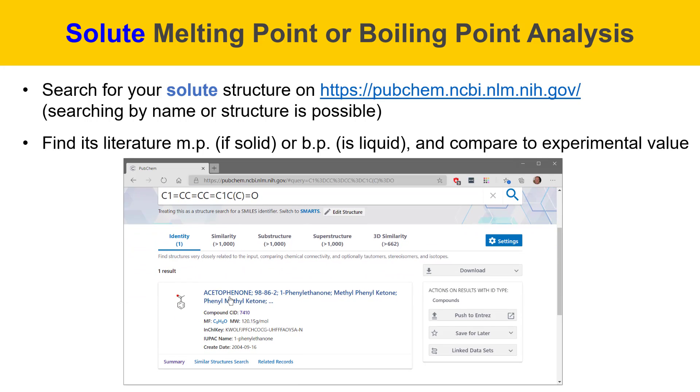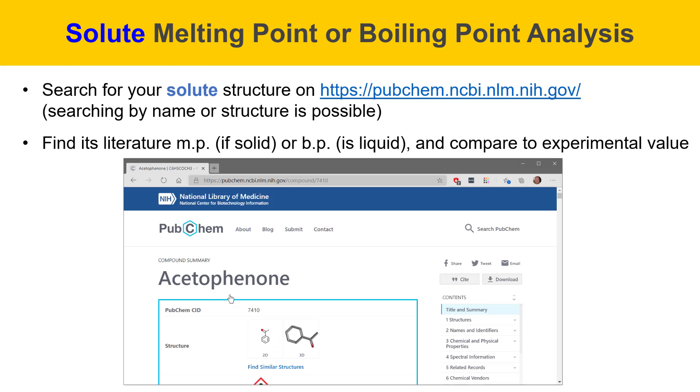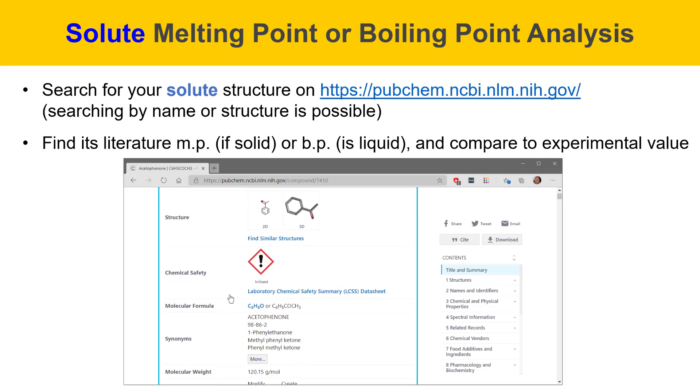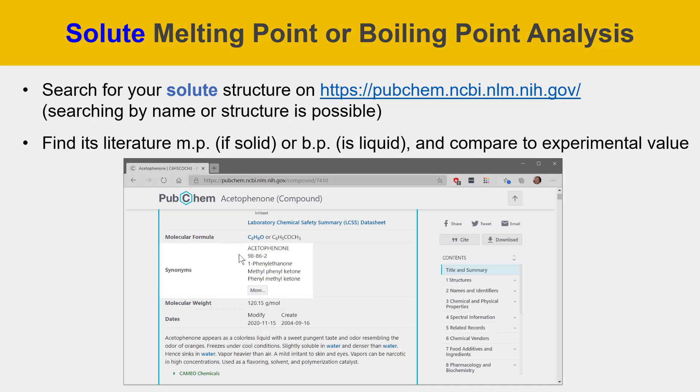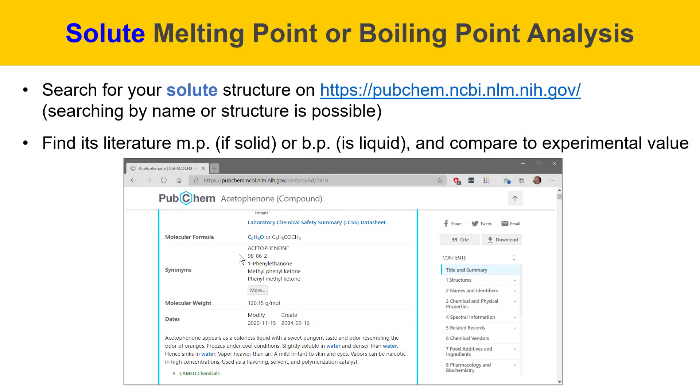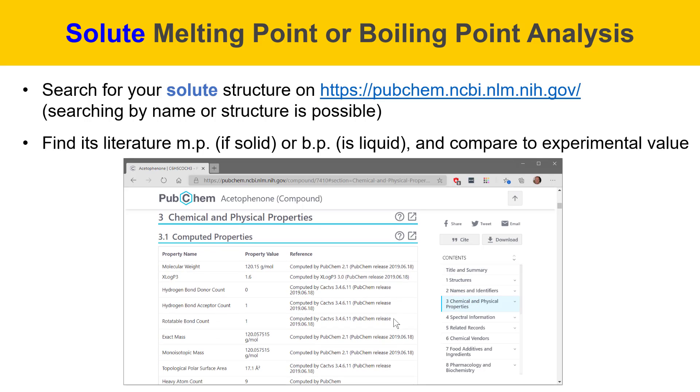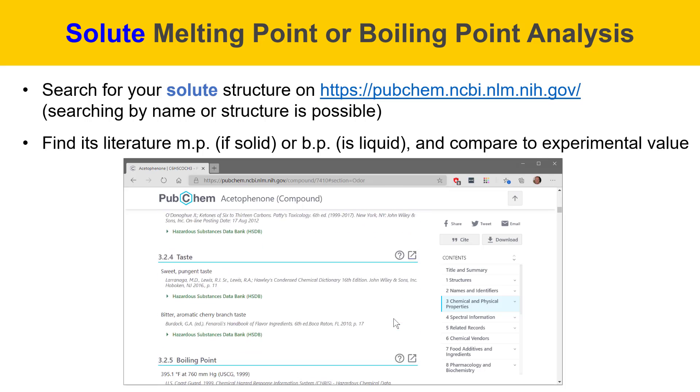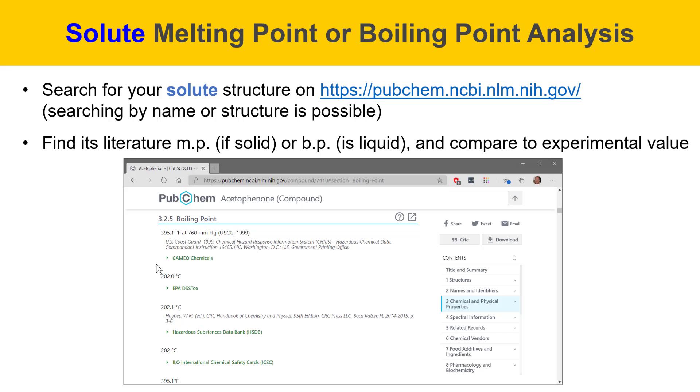Now I'll search for this structure and what comes up is a name for a molecule called acetophenone. I'll click on that and it'll bring up the properties for this acetophenone molecule. You can see it has many different aliases. Acetophenone is just one name it's known as. It also has a CAS number, 1-phenylethanone is another name for it, methylphenylketone is yet another name for it, and so on. If I want to get to chemical and physical properties, I'll click on this tab over here on the right. Then I'll scroll down through the various properties to find boiling point, which is the first thing I'm looking for. Here you can see the entry for boiling point. There are entries that are listed in Fahrenheit and some that are in Celsius. The first entry has 760 millimeters of mercury listed after it, which is the pressure that this boiling point was acquired at, which is atmospheric pressure. If this were a different number, something other than 760, it would affect the boiling point. Lower pressures result in lower boiling points.